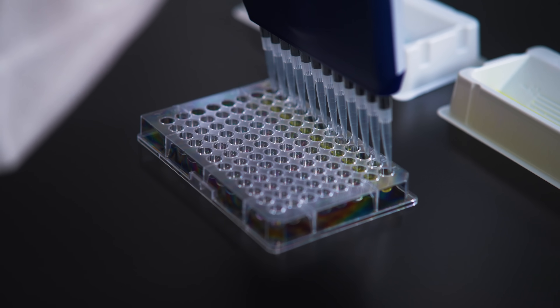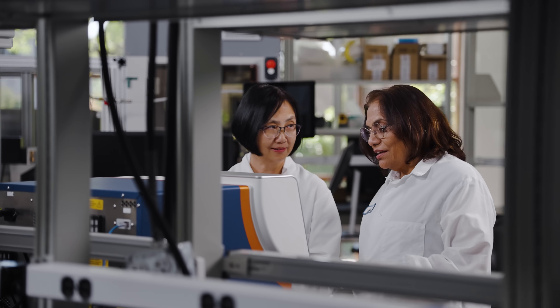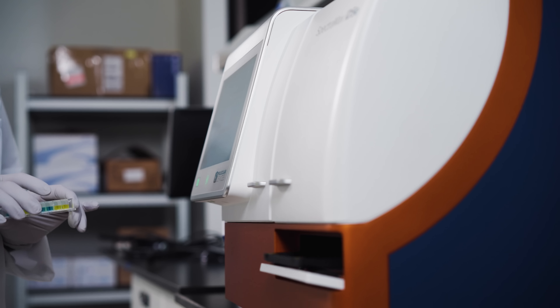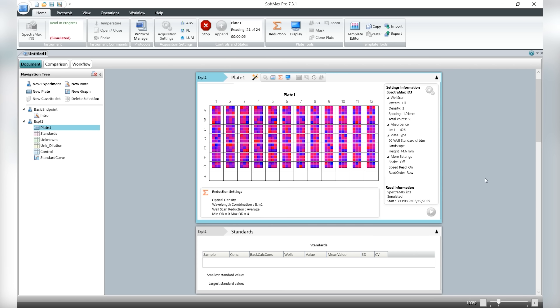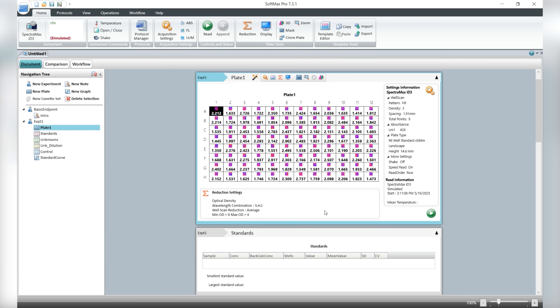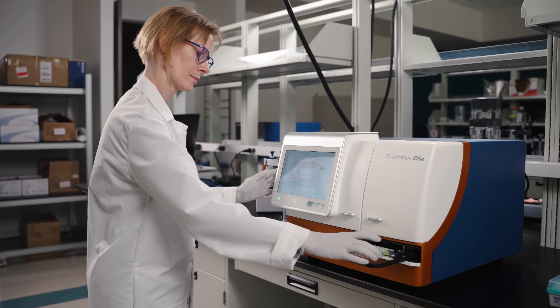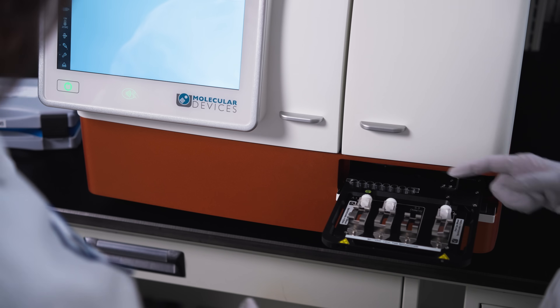In today's fast-moving world of scientific discovery, precision, flexibility, and reliability is essential. That's why Molecular Devices has upgraded the industry-leading microplate readers that you know and trust, giving you more control over conditions for critical assays. Introducing the new SpectraMax ID series, a pair of multi-mode microplate readers designed to meet researchers where they are and where they're going.